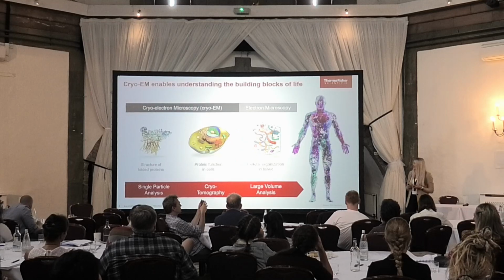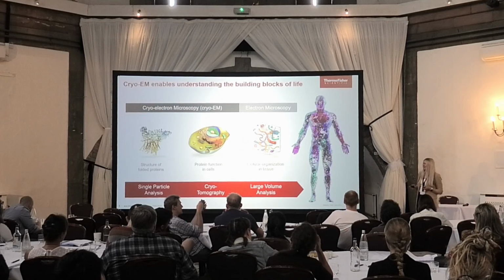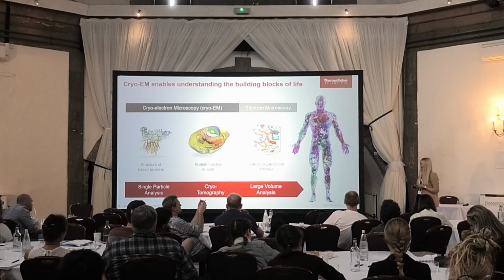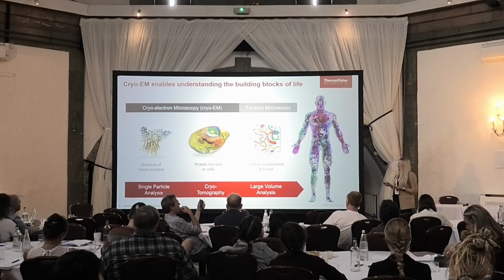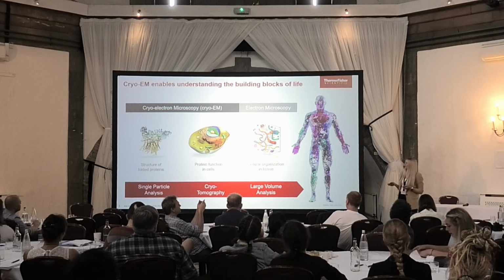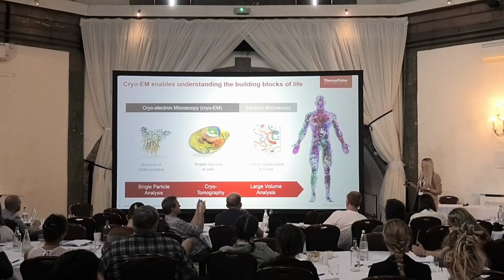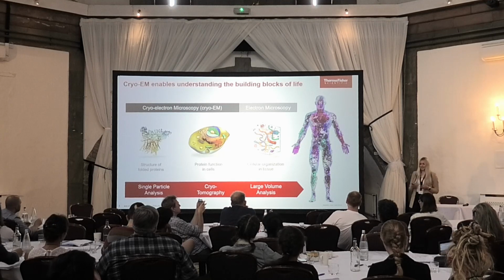Yeah. So I know that pretty much every talk is using cryo-EM here, and there are also a lot of people in the audience who've been doing this for a very long time. But I also know that some of you are quite new to the field, so I thought I would start a little bit earlier on and just start with the fact that there are 3 major branches of cryo-electron microscopy. So we have single particle analysis, cryo-ET, and also large volume analysis. And I will cover all of these a little bit today.